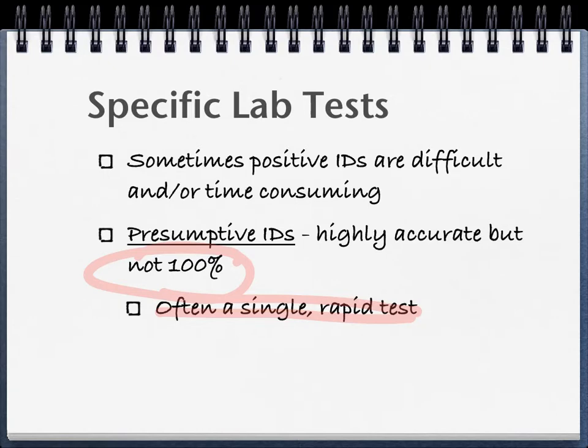But you can say, well, I know this, and this. I'm pretty sure it's going to be somewhere around here. My presumptive test will now let me determine this or that. Does that make sense? So that's a very important thing about the presumptive ID. Fast, super easy. Really allows you to get at the heart of the problem in a quick way. But you can't just do it. You need some information.